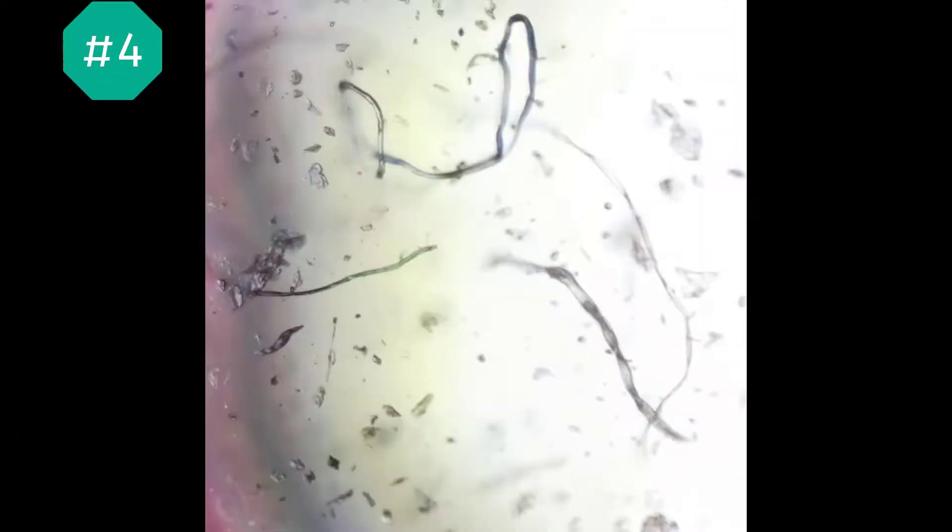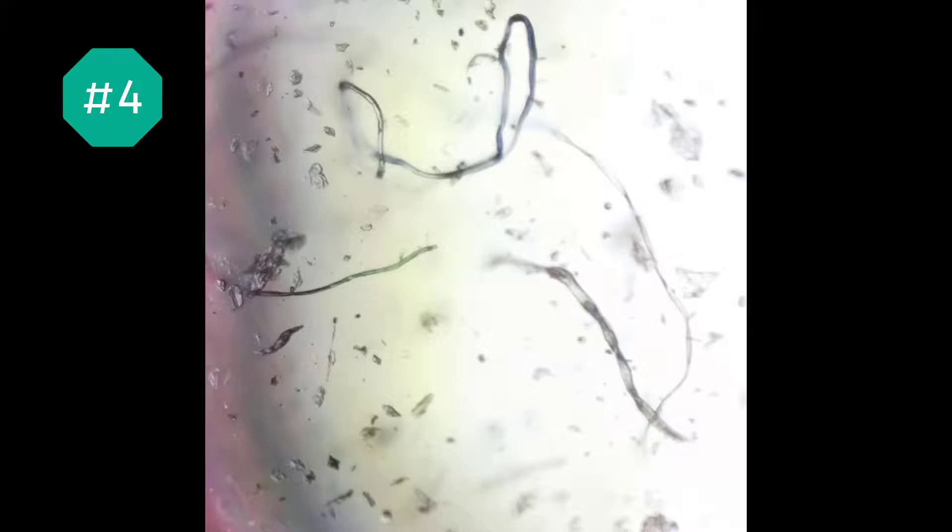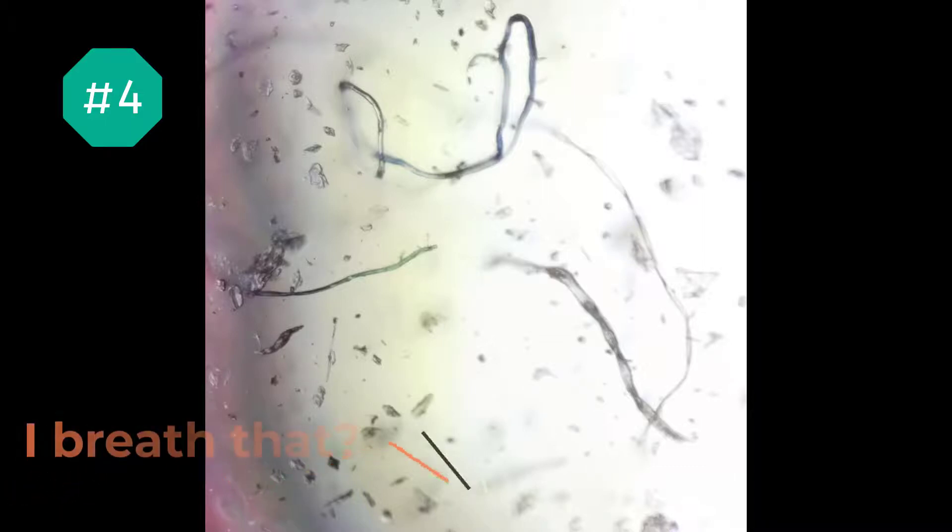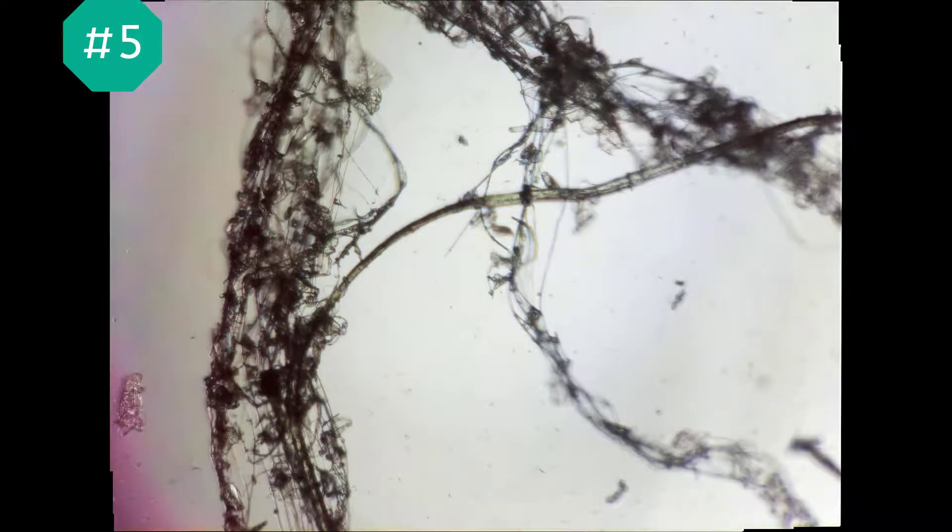This brings us to number four. Yes, that is plain old household dust. What sticks out to me is how many shapes there are. It looks like various hair and fur, and I'm guessing that some of those are pieces of skin, cotton fuzz from clothing, and who knows what else. Looks like it's time to put my air purifier on high for a while.